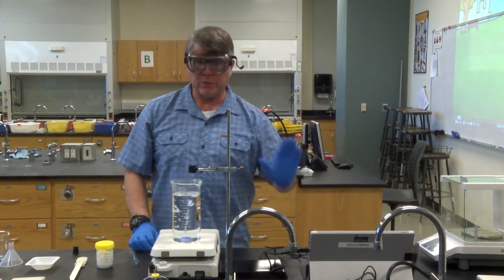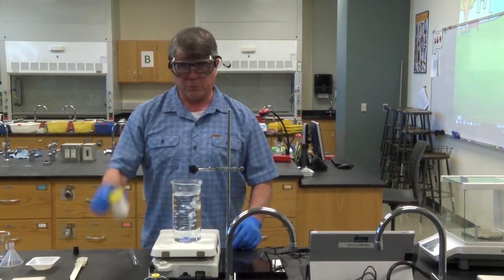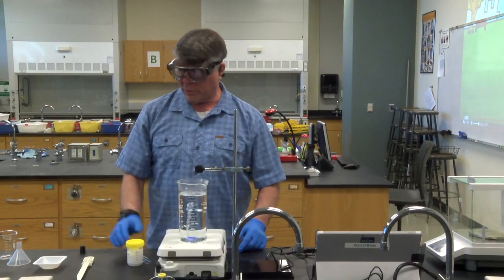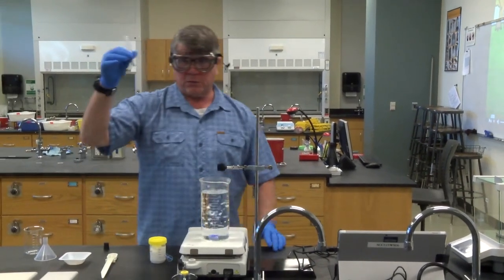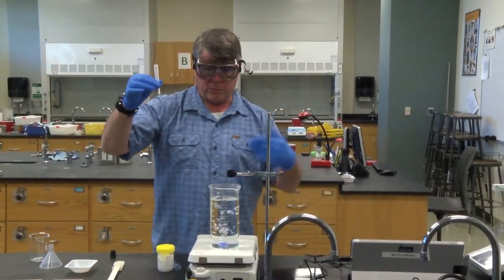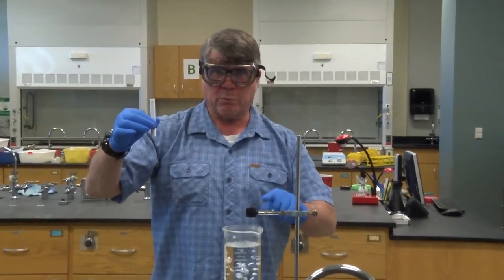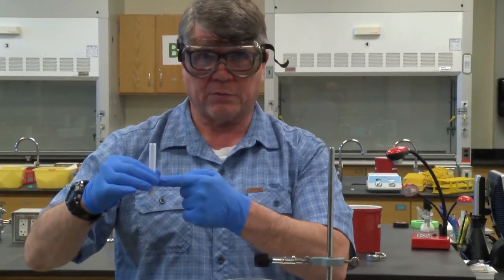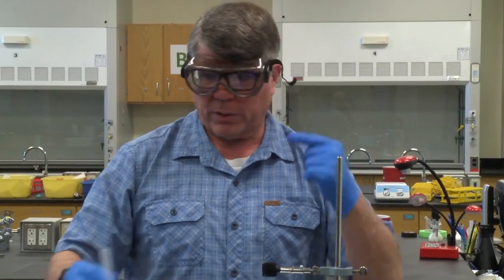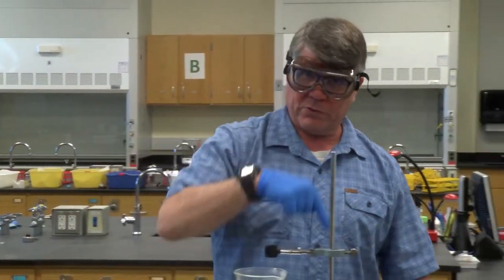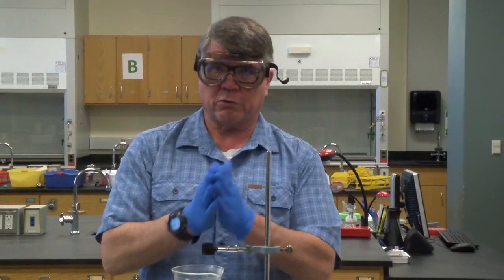Our goal is to determine the freezing or melting point of the pure stuff, and then you're going to have an unknown. That's going to be your solute. After you measure the freezing point of the pure substance, you're going to add the solute, the unknown to it, and measure the new freezing point. Now we know that when you add a solute to a solvent, the freezing point goes down, and so the new freezing point should be lower.